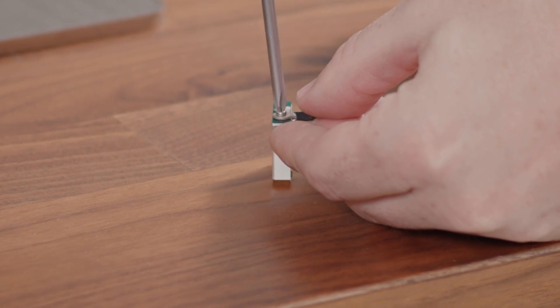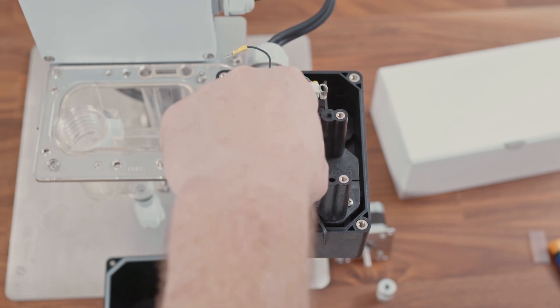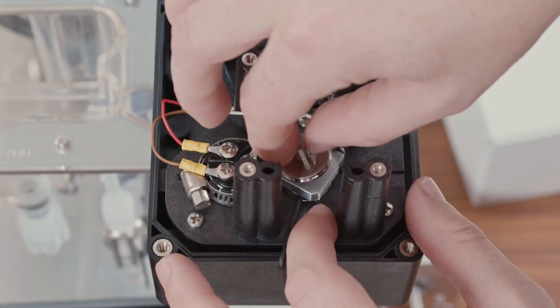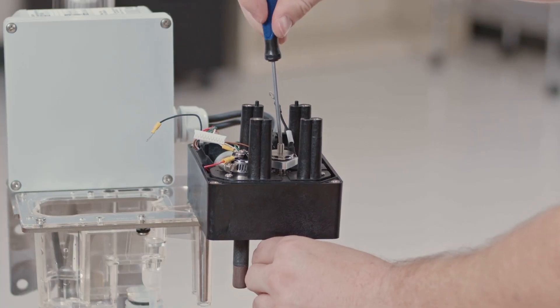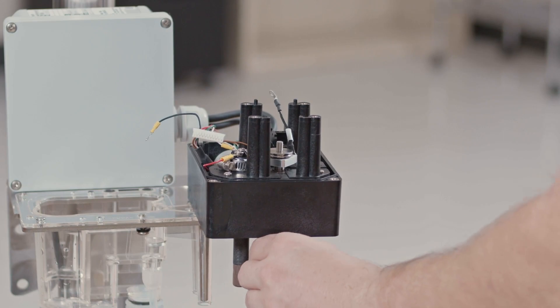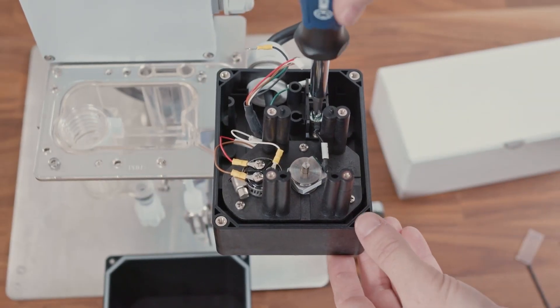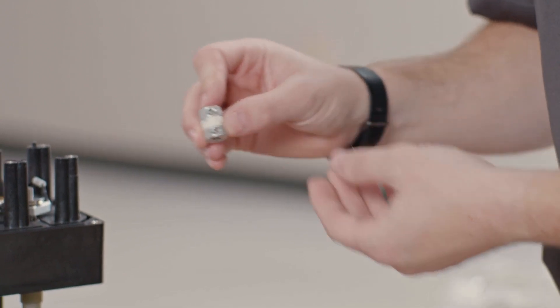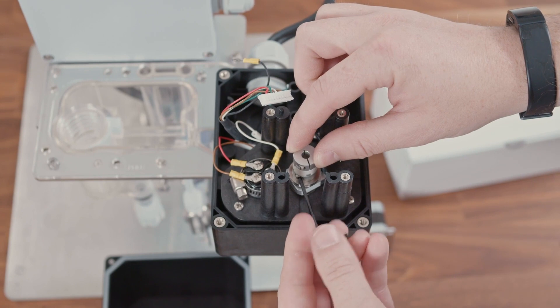With that wire attached, we'll now install the new contact. Handling from the sides, put the new contact onto the lower drive shaft, positioning it so that the wire can reach the terminal that it came off of. We can now install the retention screw, first starting off by hand until it's tight and then giving it a little bit tighter with a flathead screwdriver. At this point you can go ahead and screw the wire back into the terminal. We can then replace the coupling on top of the retention screw and begin rebuilding the motor assembly.